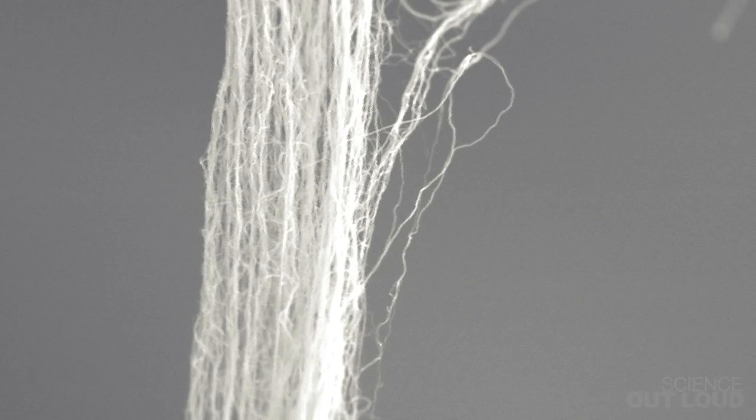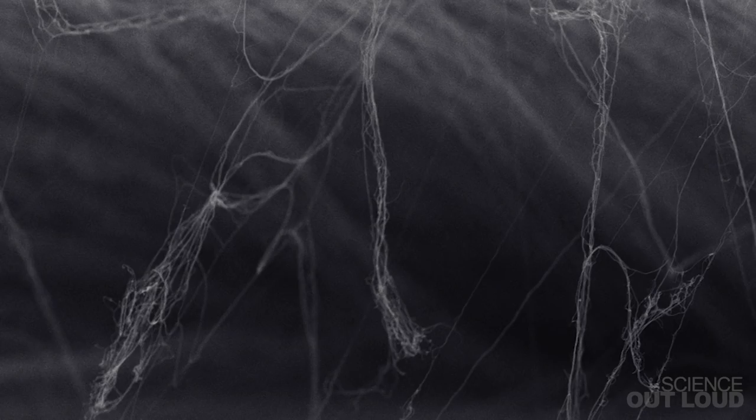And this is what they look like under a high-power microscope. As you've just seen, making carbon nanotubes doesn't require some magical process, and they're already being used in common everyday objects.